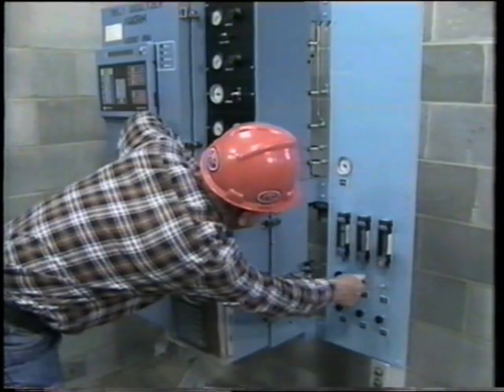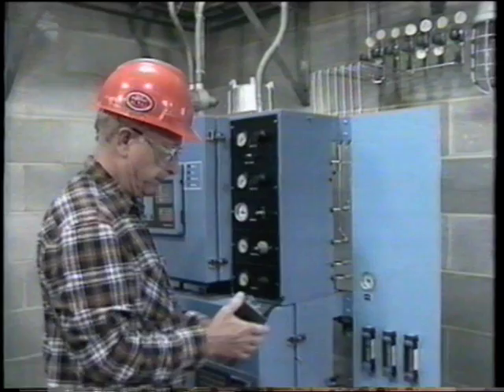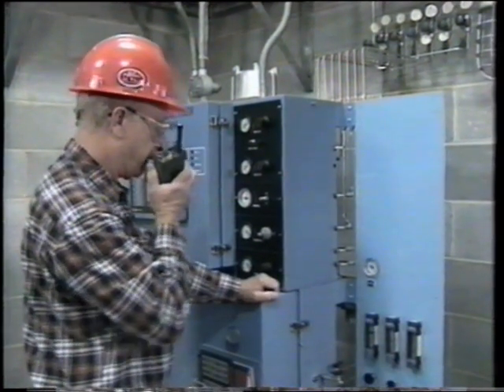In the next segment, you'll learn about sampling system maintenance. But for now, review your workbook to learn more about gas chromatograph operation.